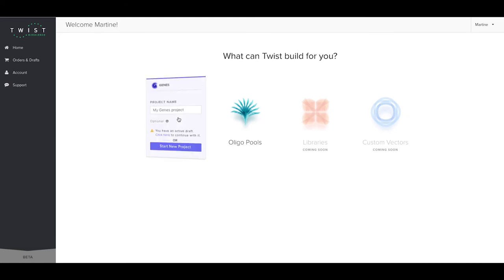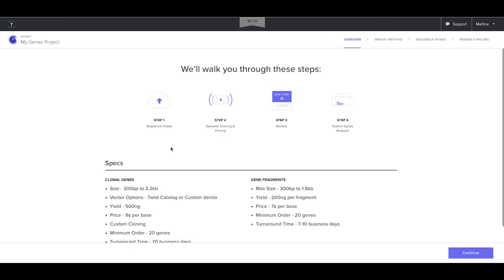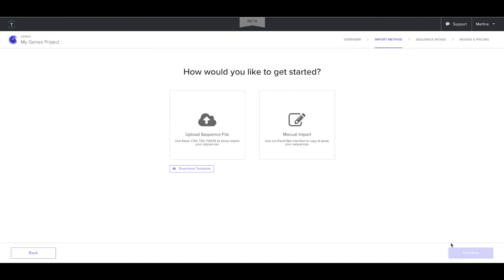First, select the genes app and name your project, then start the new project. Here you can review the specifications for clonal genes and gene fragments and then proceed to the next step.